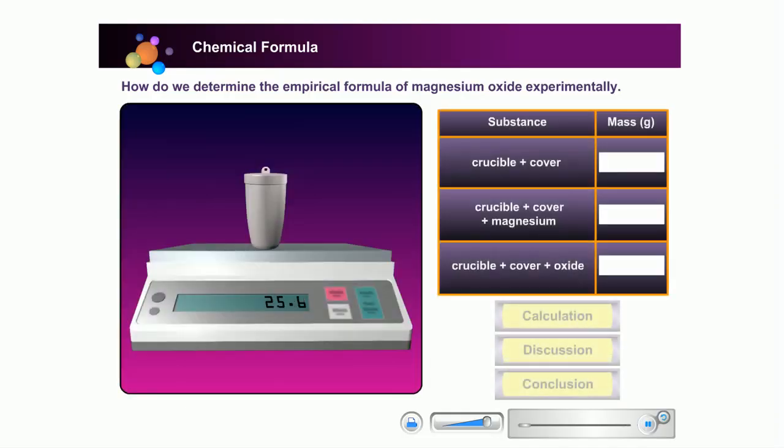How do we determine the empirical formula of magnesium oxide experimentally? Weigh an empty crucible and its cover, record the mass. Key in the mass in the table provided.